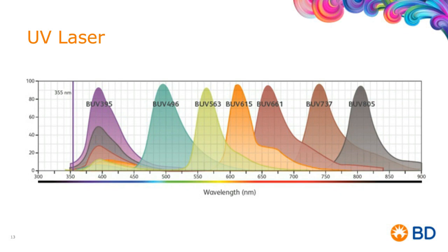Now, the tertiary markers are different. These tertiary markers are oftentimes what Mario had defined earlier as being very small numbers of receptors per cell. Very, very small numbers. And we see markers like the CD132s that are around 100 receptors or 50 or 80 receptors. And then along with that are activation markers that change over time.